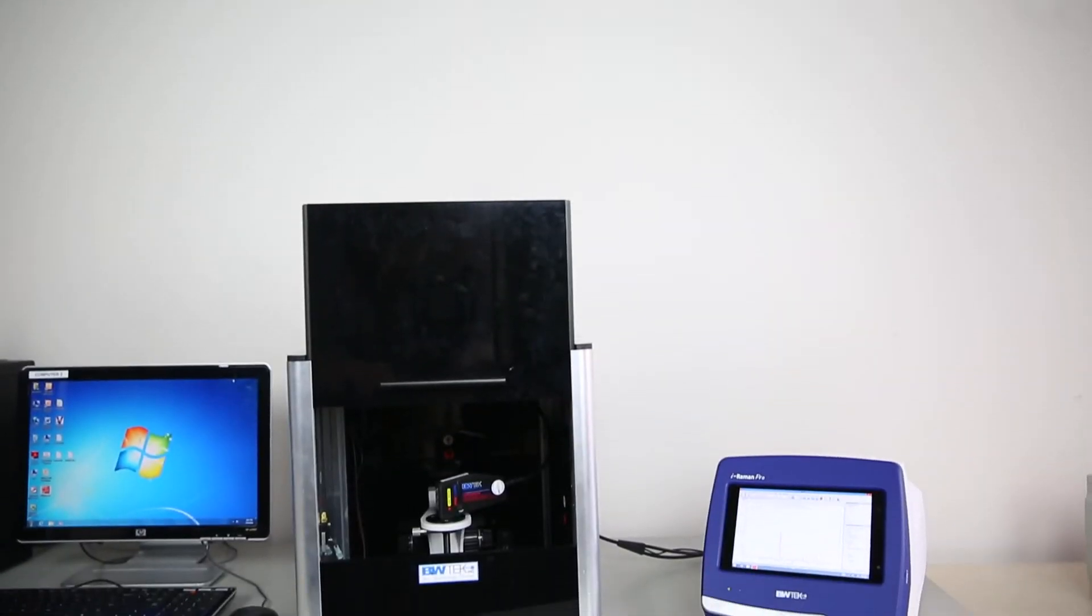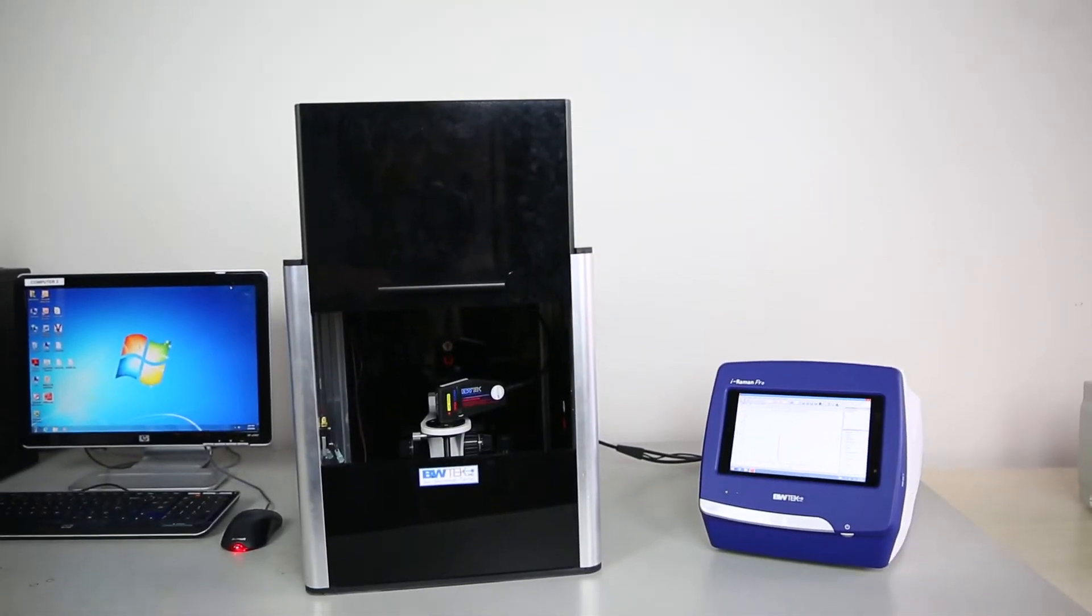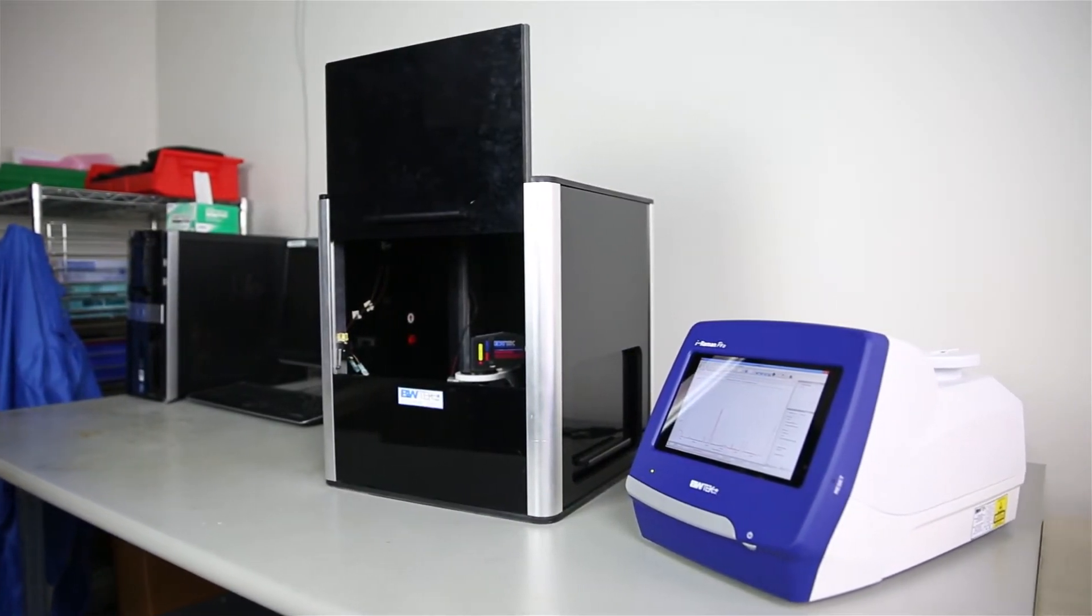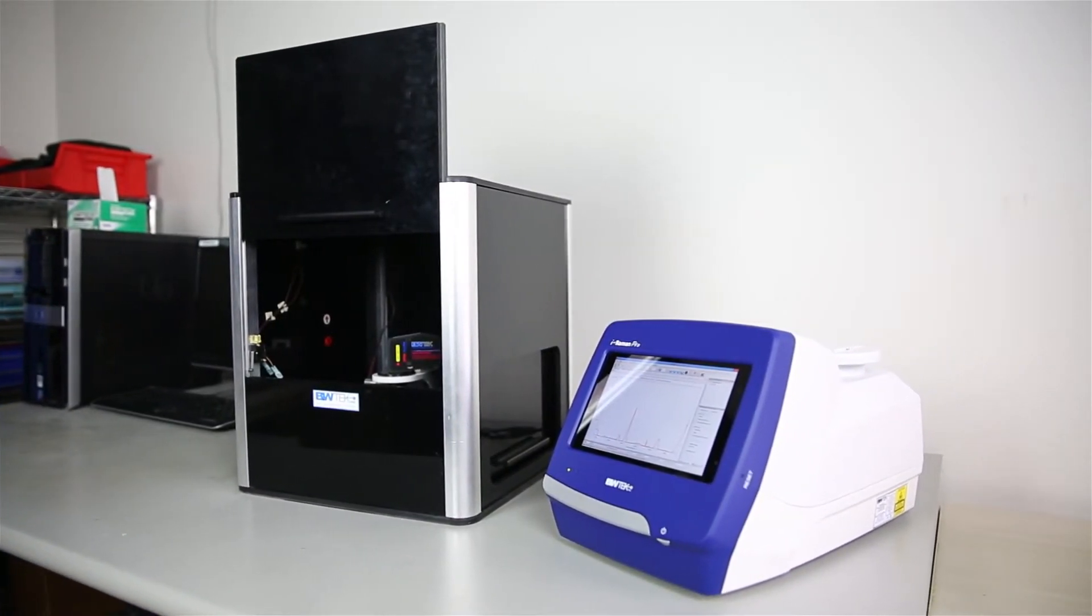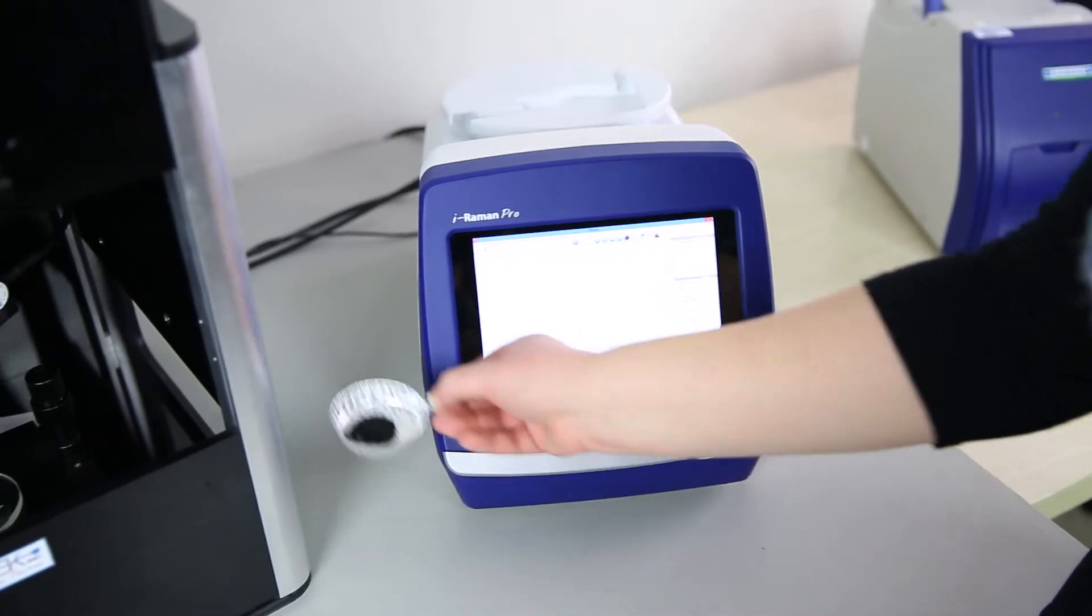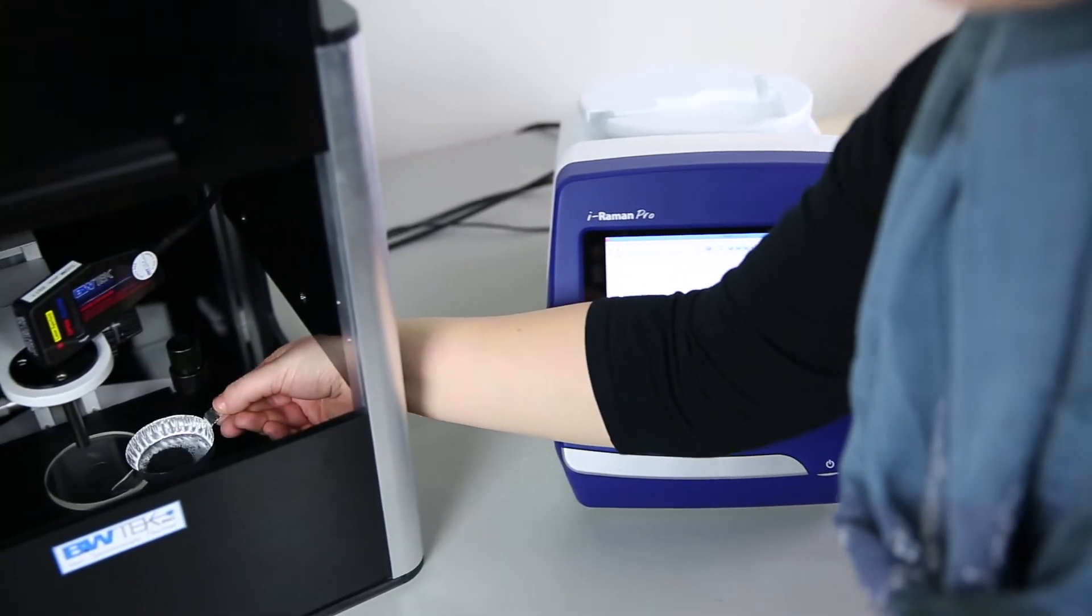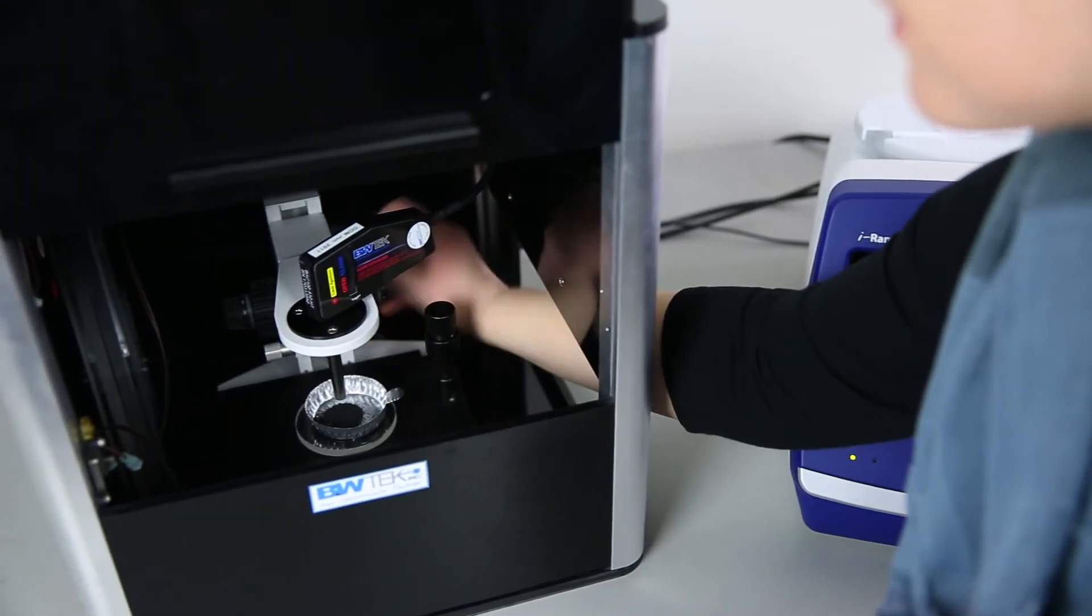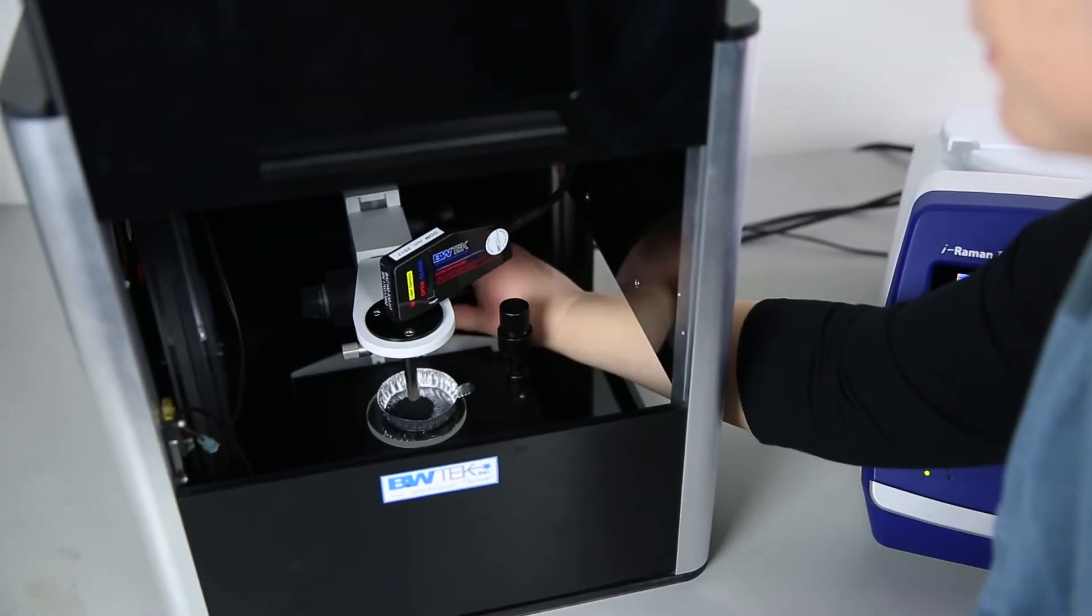This portable instrument utilizes a high-throughput Raman system with a back-thin CCD and 532 nanometer laser excitation via a fiber-optic sampling probe. The Carbon Raman Analyzer comes equipped with a probe holder and an adjustable XYZ stage for reproducible measurements, as well as a class 1 laser enclosure for safe operation.